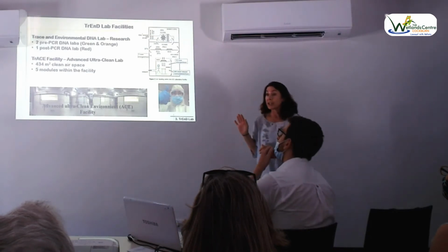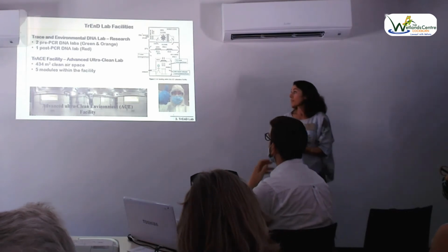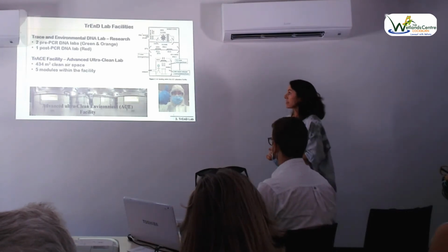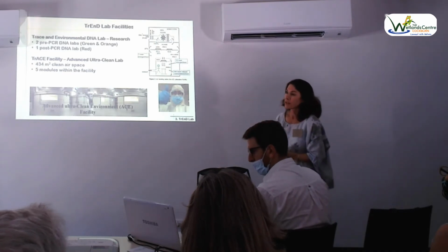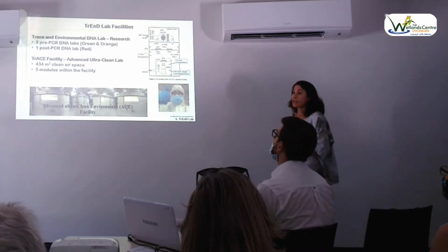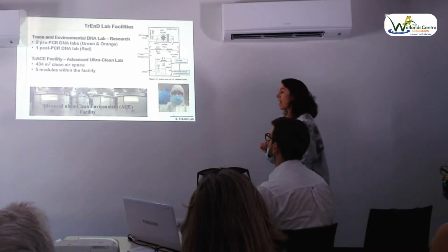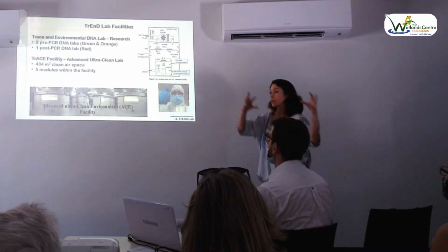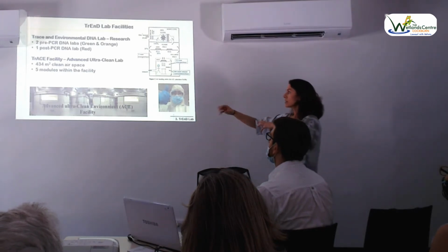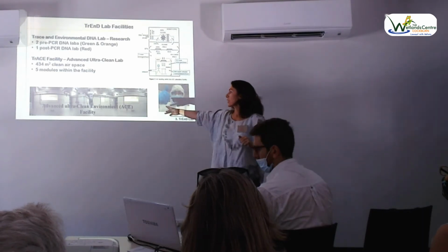We're very fortunate at Curtin University. We have some awesome facilities, and I'm on a national working group writing best practice and standard guidelines for environmental DNA. The basic minimum is a clear separation of your pre and post PCRs. We go one step above that, and we have an ultra clean environment.